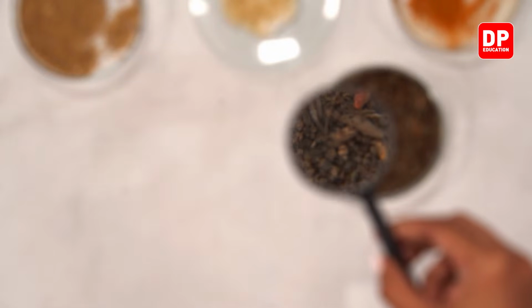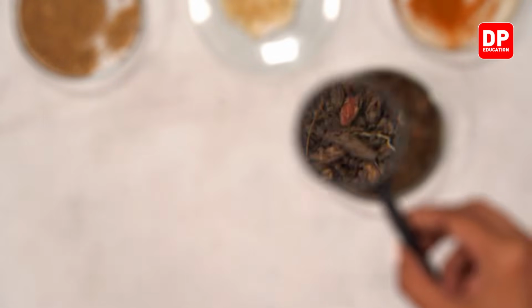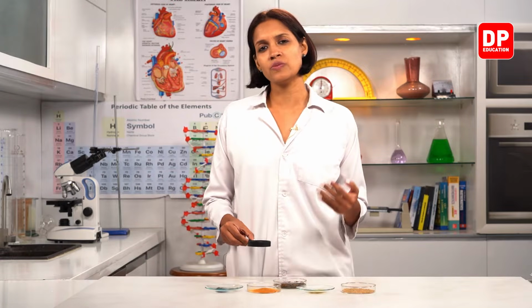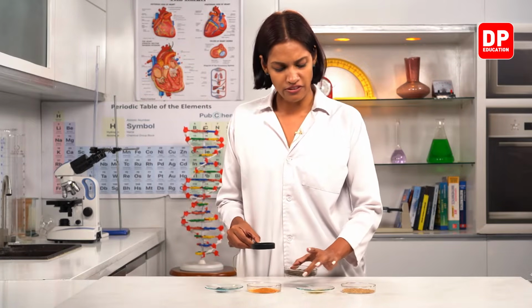There's a snail shell. Can you all see that one? Gravel, tiny other pieces present. So the things that are present in each soil sample differ based on the place where we obtain the soil sample from, right? And even the colors are also different.